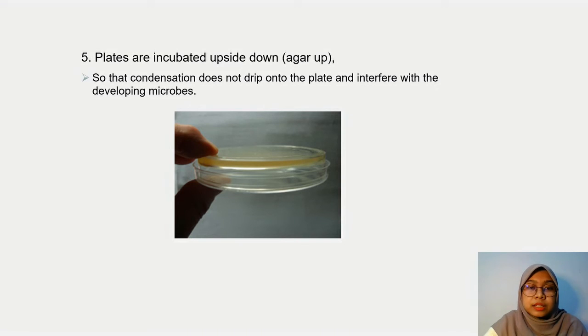Last but not least, the plate that needs to be incubated must be upside down, which means the agar must be up, so that the condensation does not drip onto the plate and interfere with the developing microbe.